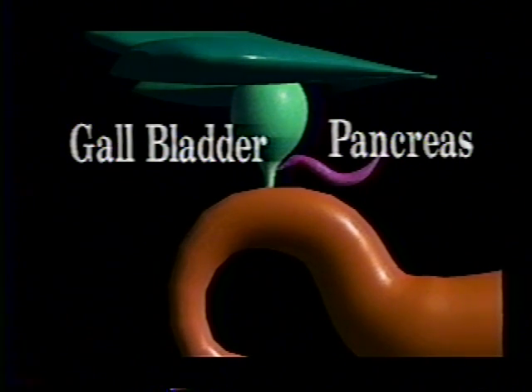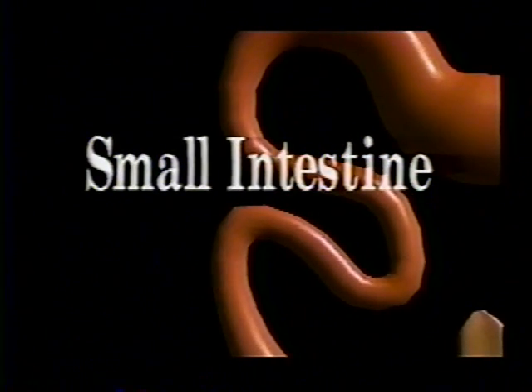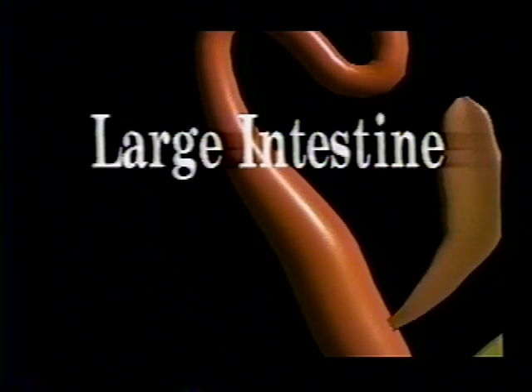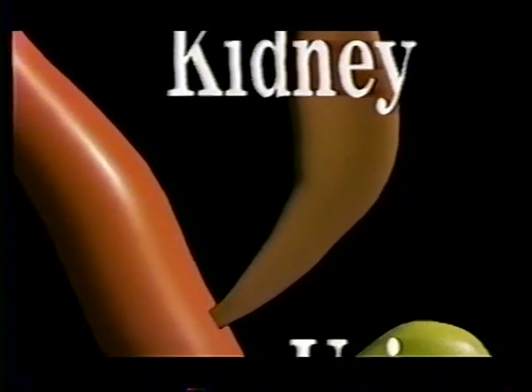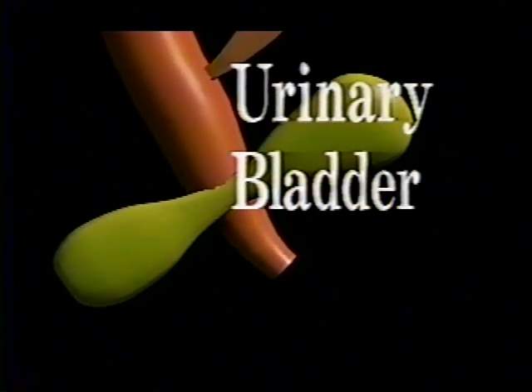These juices aid in the extraction of nutrients while the food passes through the small intestine. From the small intestine, the food travels to the large intestine. The kidney extracts contaminants from the frog's blood and concentrates these contaminants in urine. The urine is stored in the urinary bladder until excreted out of the frog.